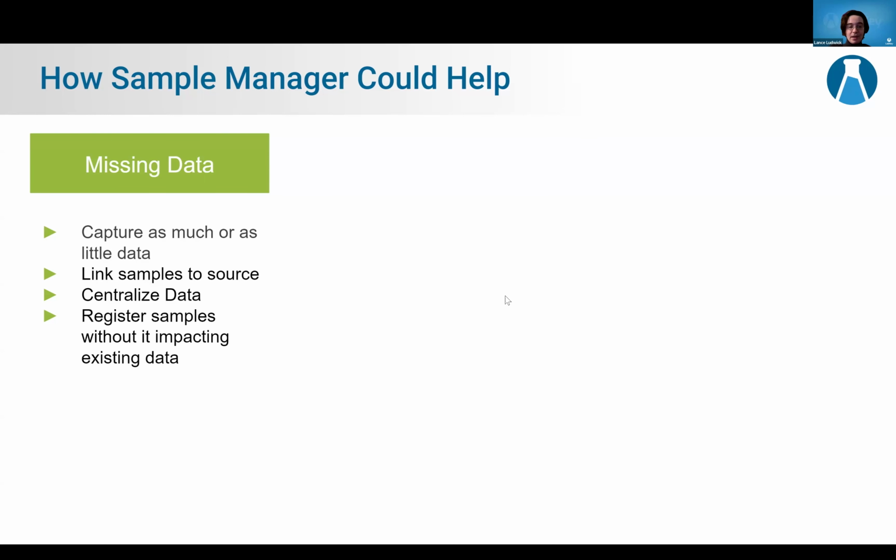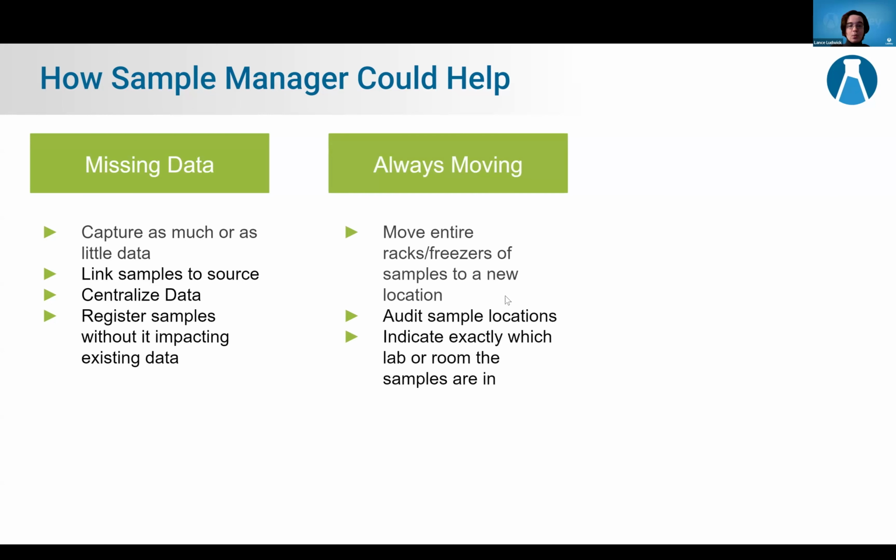And then really when these samples were moving, I could check them in and out of our freezers very quickly within Sample Manager. In Sample Manager, you can check out an entire shelf or an entire rack or an entire freezer into another location. So I would always have up-to-date information on where these samples were. And this would have been super useful when they needed to defrost a freezer and I didn't come back and wonder, oh no, where did my samples go? They're right here. It's totally fine.